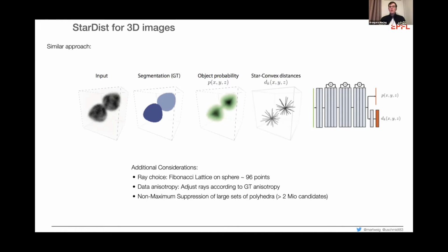Okay, so I didn't catch that, as after the segmentation. So this is done automatically, right? So you annotate only the foreground and background. So this is all done under the hood, because you don't really know what's the actual center of the object. You just have the probability. So do you just go to the one with the highest probability?